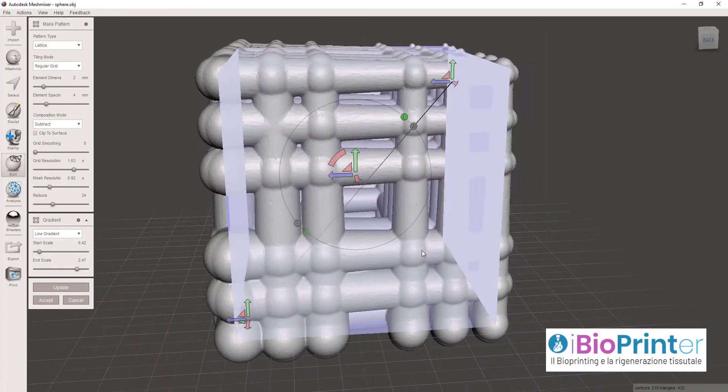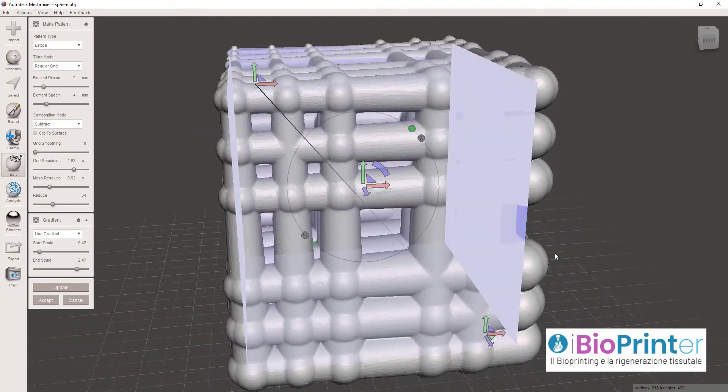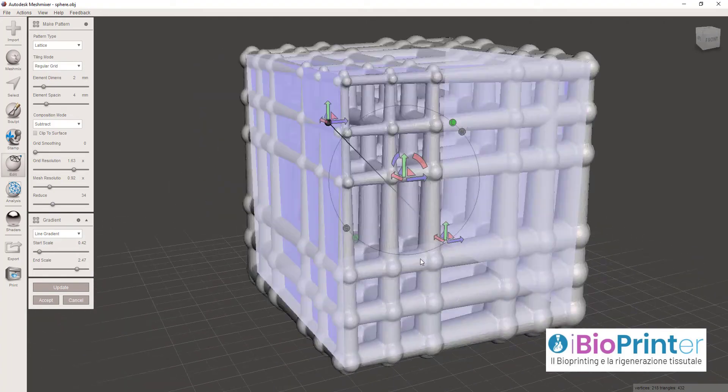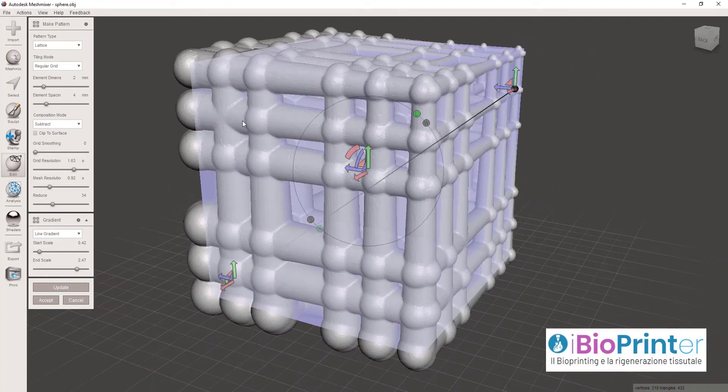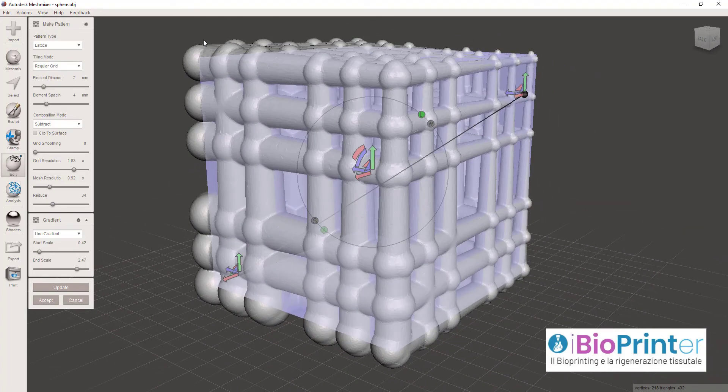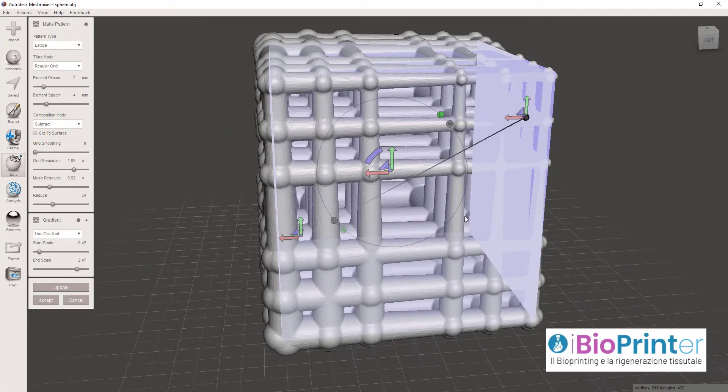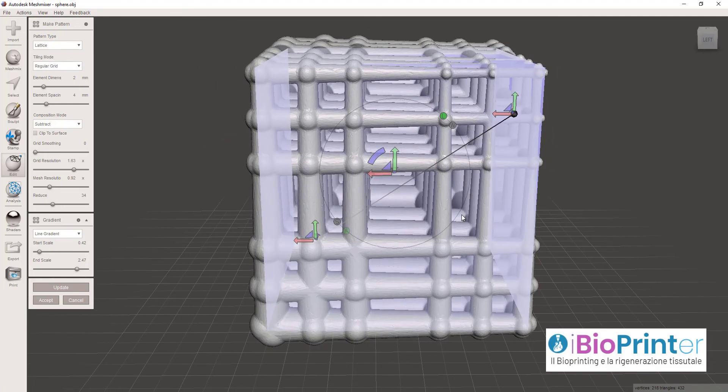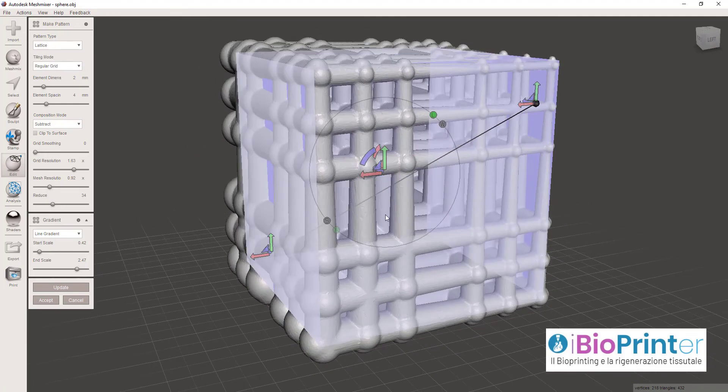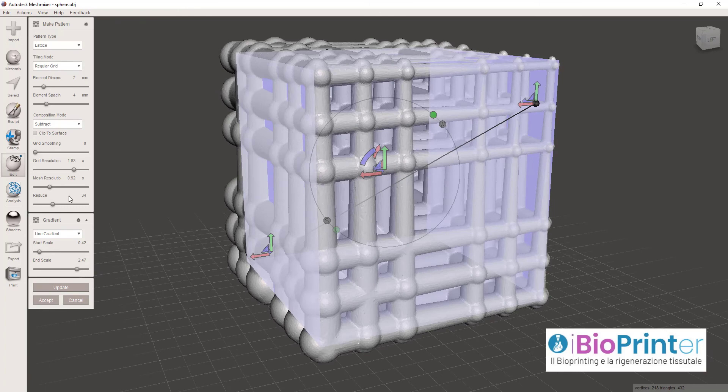Eccola qui, vedete la stessa cosa di prima però in positivo, quindi strutture lineari reticolari più grandi da questa parte del cubo, mano a mano le dimensioni sono decrescenti verso la parte opposta.